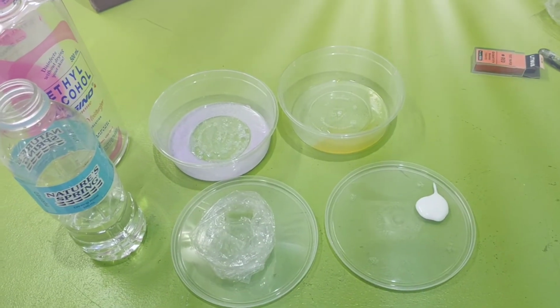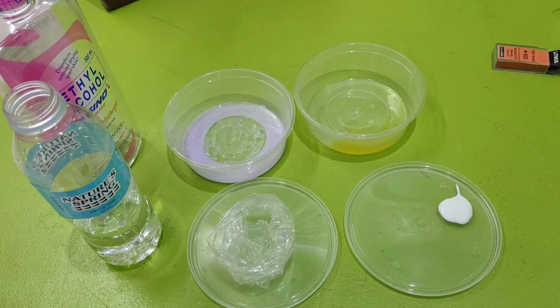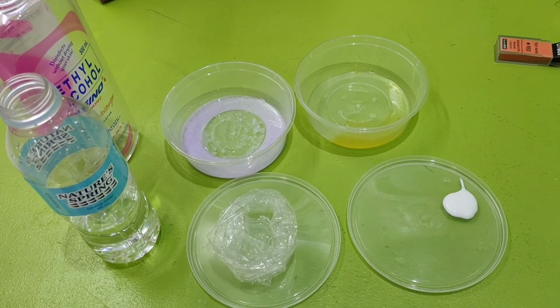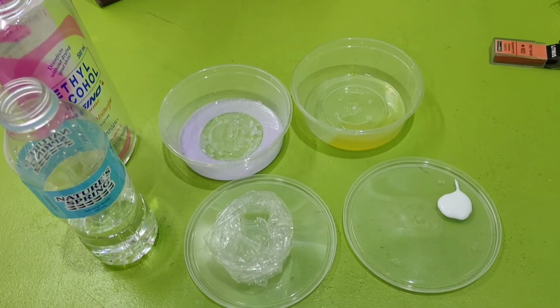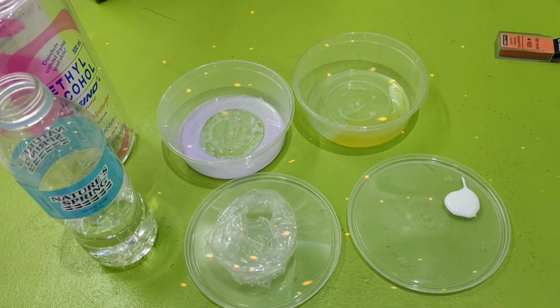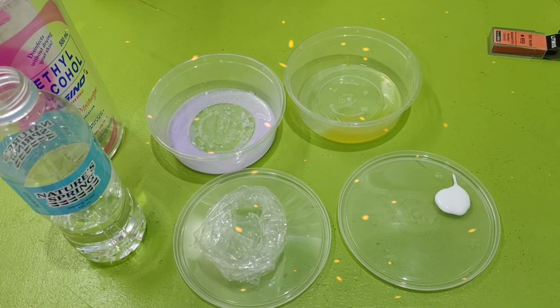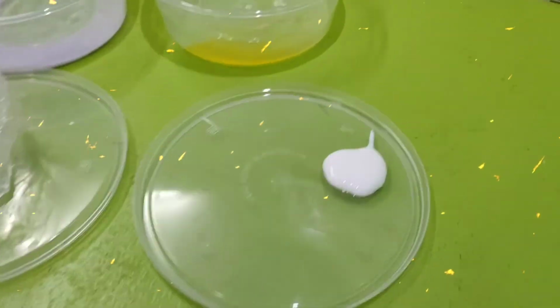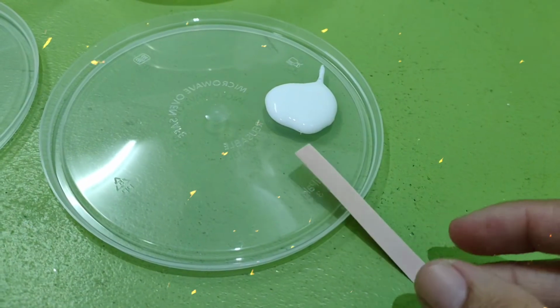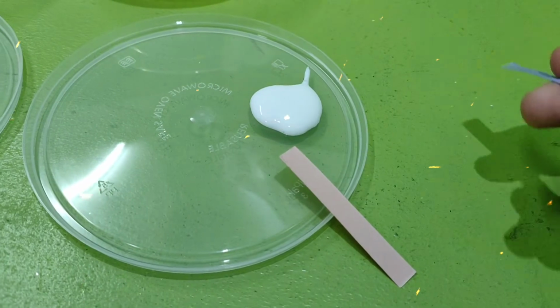Okay. So ngayon, ito yung mga materials or examples, substances that we will check if it is an acid or if it is a base. So malalaman natin ngayon kung ang mga halimbawang ito ay isang base ba or isang acid. Okay. First, let us check this one. I will use a red litmus paper and also a blue litmus paper. So we will check it now.